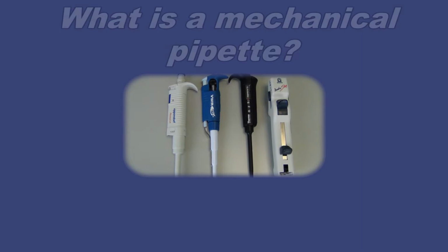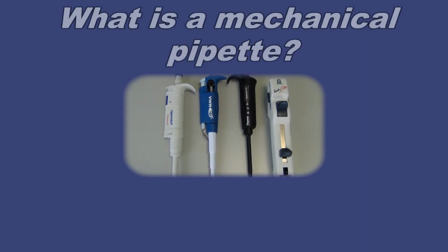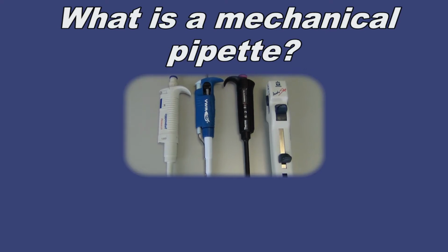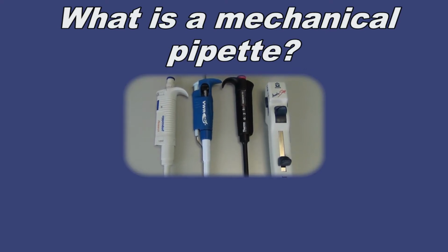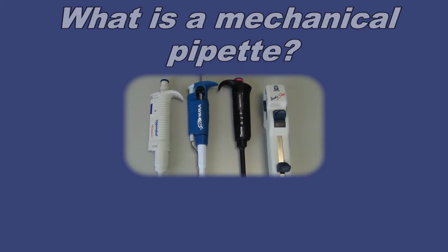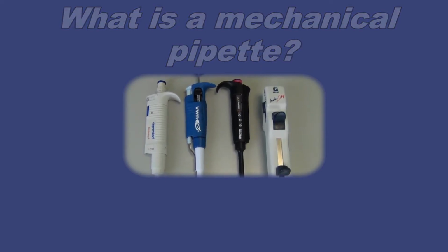A pipette is a laboratory tool used to measure a small volume of liquid. This video will show the types of pipettes, pipetting techniques, tips to improve pipetting techniques, physical influences, and care for the pipettes.